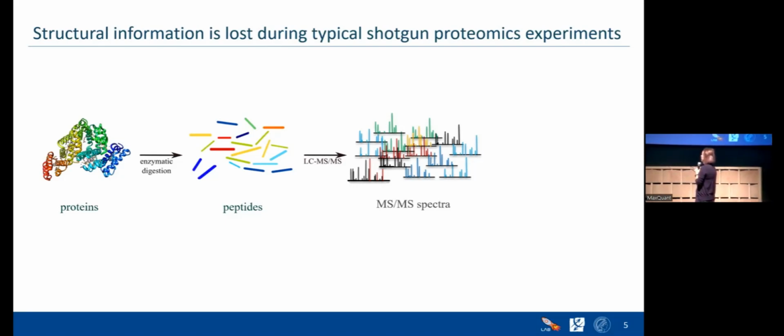And when we do LC-MS, we tend to have a spectrum coming from one peptide. Of course, it's possible to come from 2 co-eluted peptides, but we tend to want to find one peptide, one spectrum for DDA. So I'm referring here to DDA. DIA for crosslinking in our lab is planned, but not done yet.